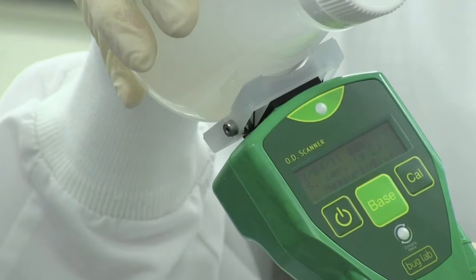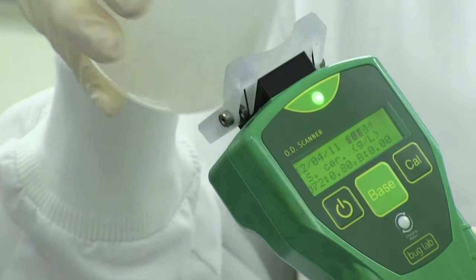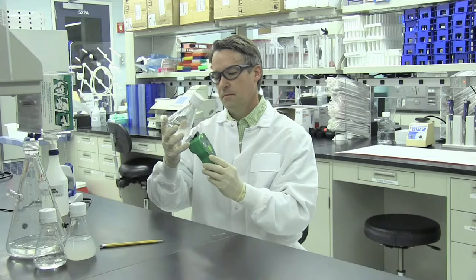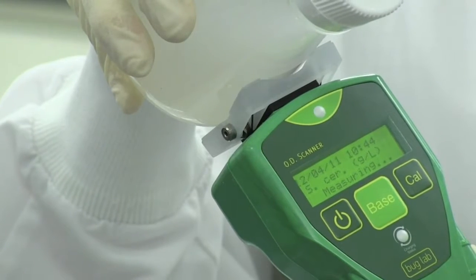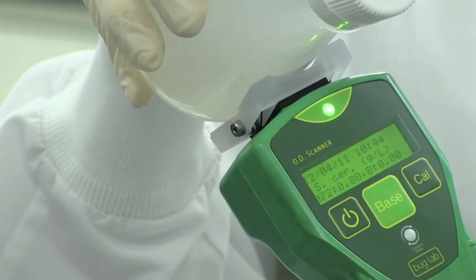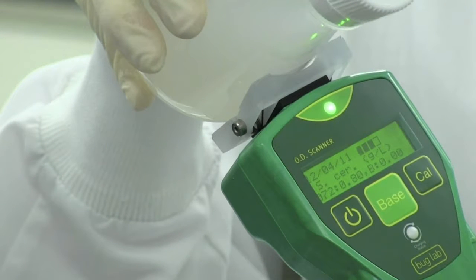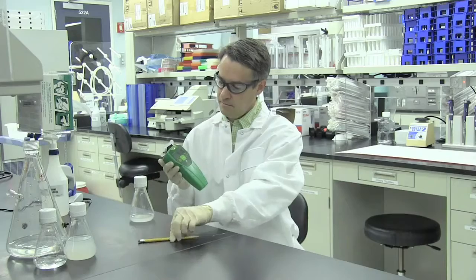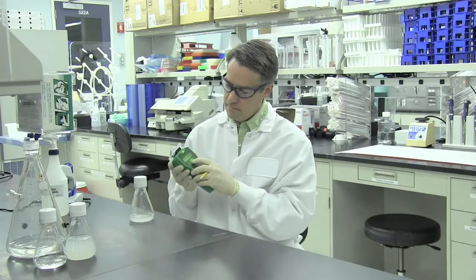The display will light up when the measurement is complete. The final sounding of 3 harmonic tones is an indication of a complete measurement. The entire measurement will take between 2 and 6 seconds. Also, as the measurement is being performed, the measurement indicator LED on the front surface of the instrument will flash green, briefly turn off, and then turn to steady green when the measurement has been successfully completed. The measurement result is shown on the bottom line of the display.